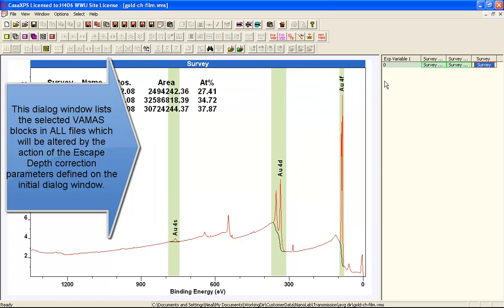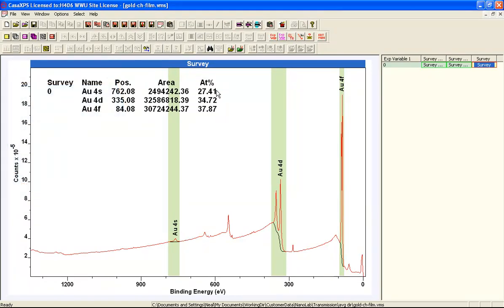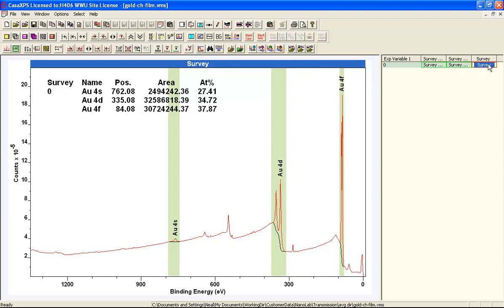And we get the same answer as we got before. So I've made no correction in addition to the escape depth correction at this point.